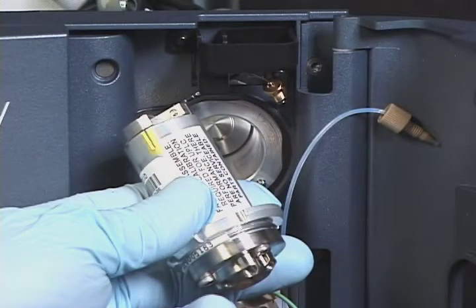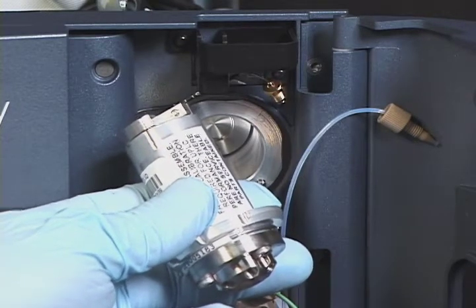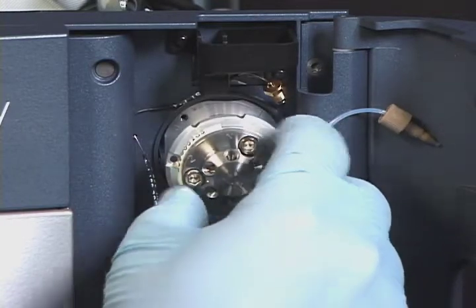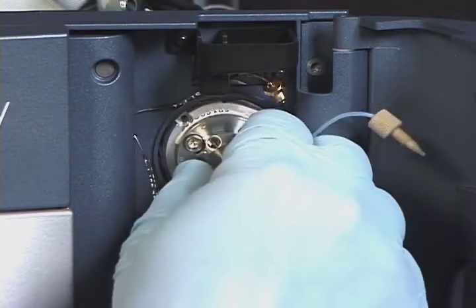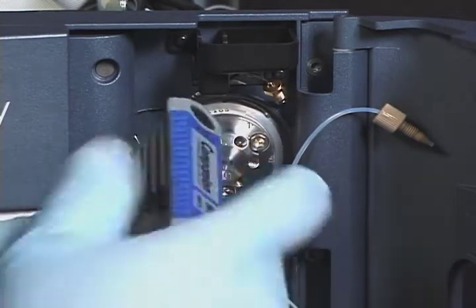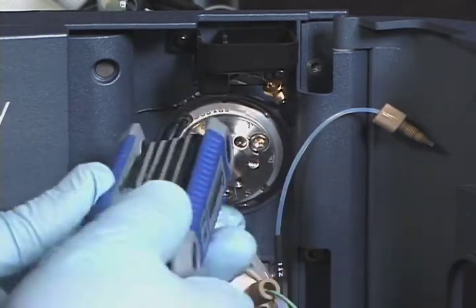To install the new cartridge, align the bottom groove in the cartridge housing with the top groove on the drive clamp, then insert the cartridge into the injection valve assembly. Secure the cartridge in place by tightening the 2mm Allen screw in the 10 o'clock position.